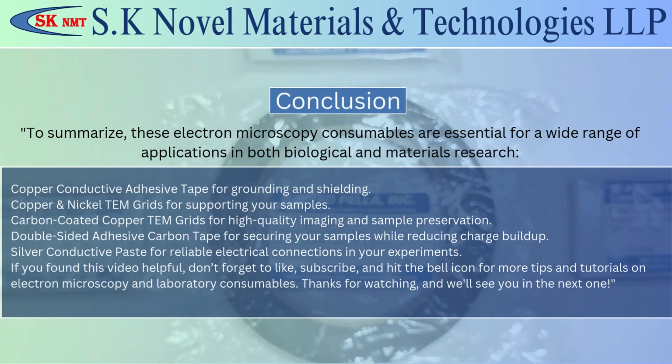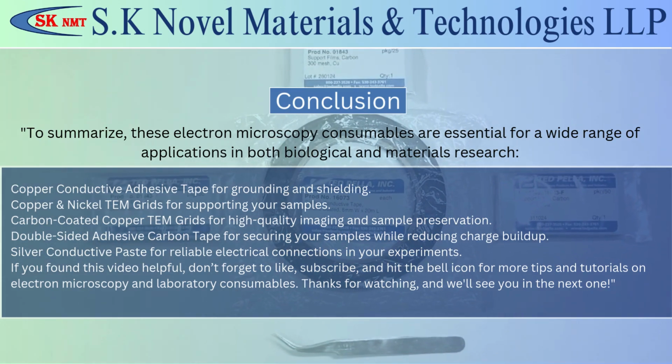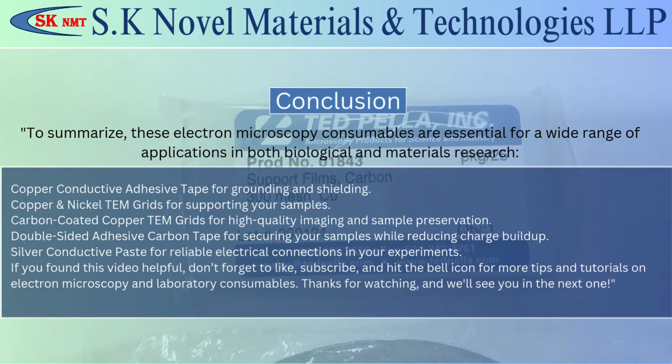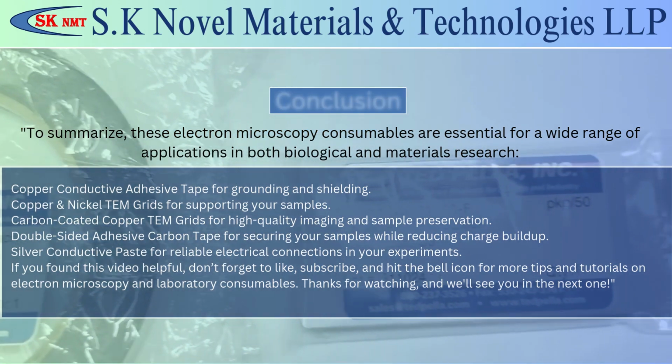To summarize, these electron microscopy consumables are essential for a wide range of applications in both biological and materials research.